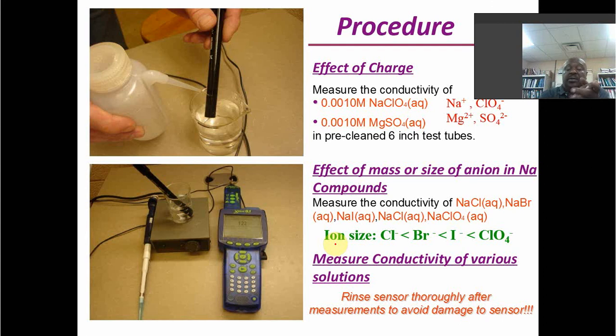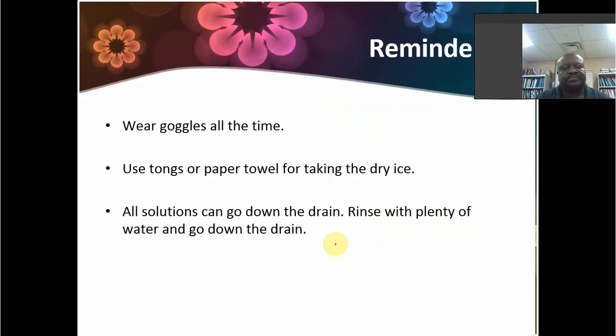And then we measure the conductivity of Windex, Pepsi, milk, orange juice, whatever. But we'll get those results, so it's not just measuring them. We'll look at that and then try to understand what is going on.